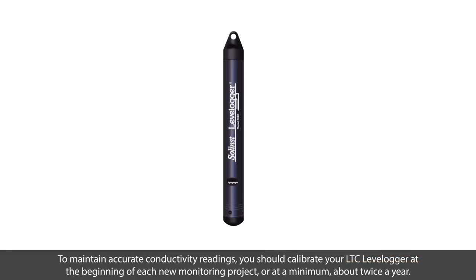To maintain accurate conductivity readings, you should calibrate your LTC Levellogger at the beginning of each new monitoring project, or at a minimum, about twice a year.